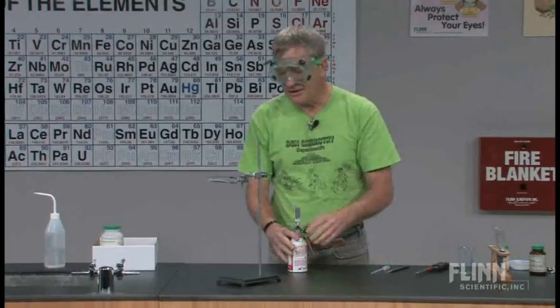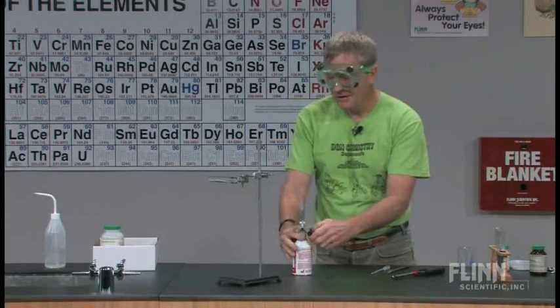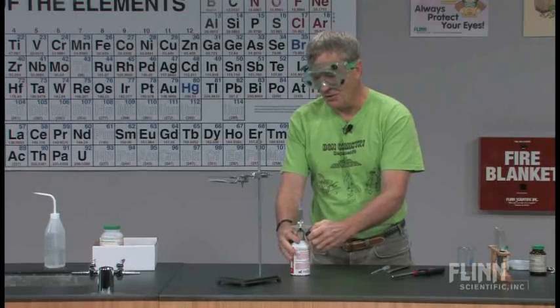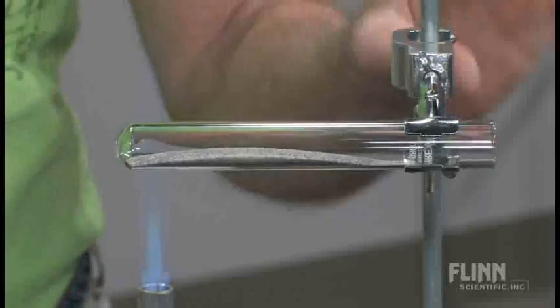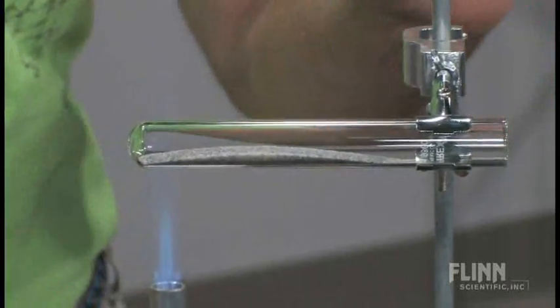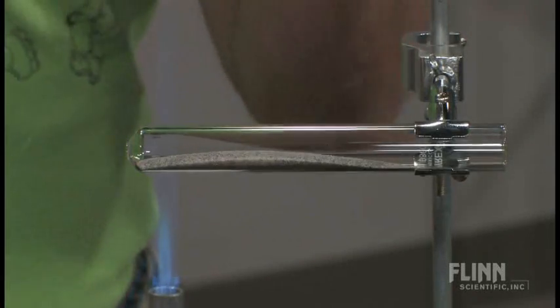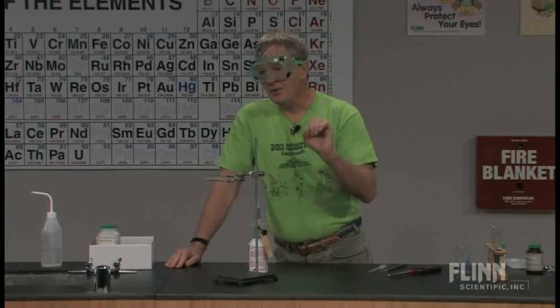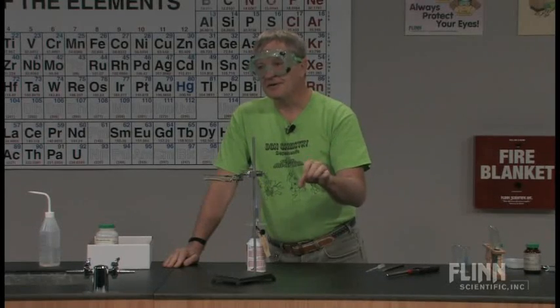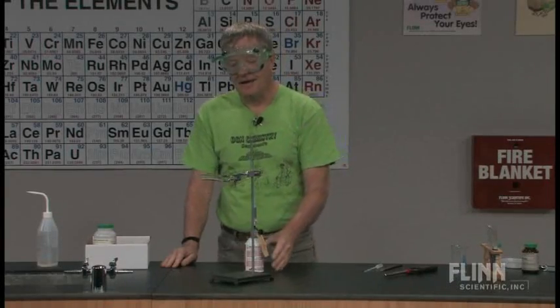And now I'm going to heat this vigorously for a little while. It's going to take a bit of time for this thing to really get going. We might want to dim the lights a little bit here. This is the point where you may hear, after I've heated it for just a short period of time, a very, very slight pop. There's always a little bit of moisture in the air. When I start heating this stuff up, some of that moisture is on the surface of the magnesium, and a little hydrogen gas gets generated, and it'll ignite. So you'll hear like a poop, and that'll be just the first bit of it.